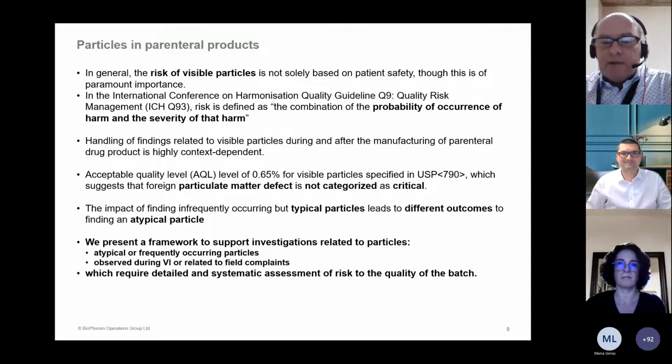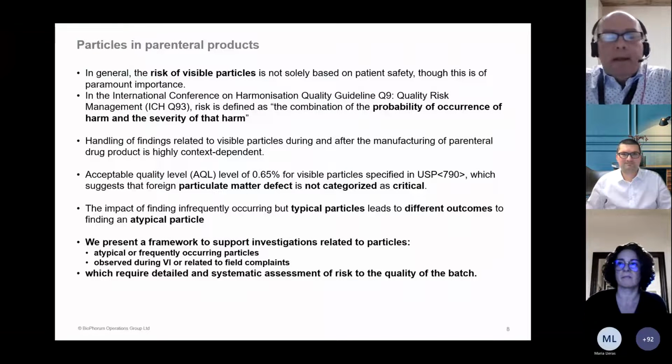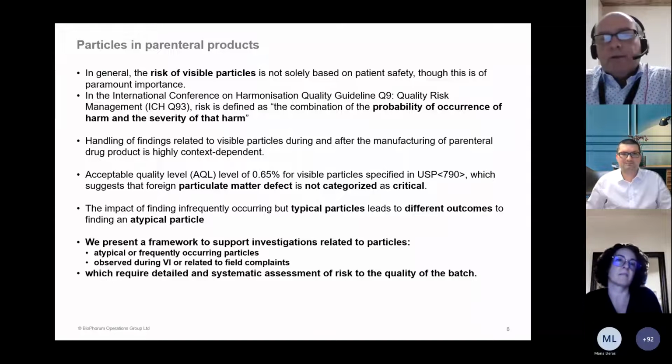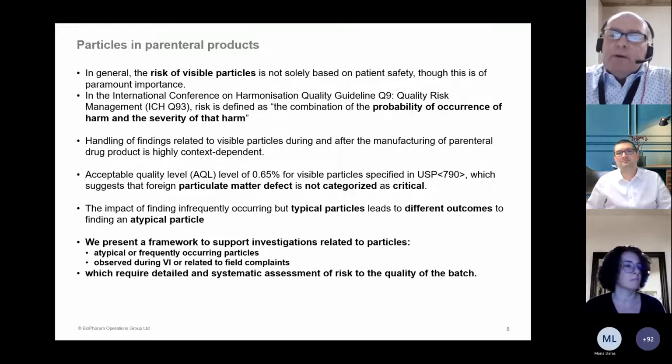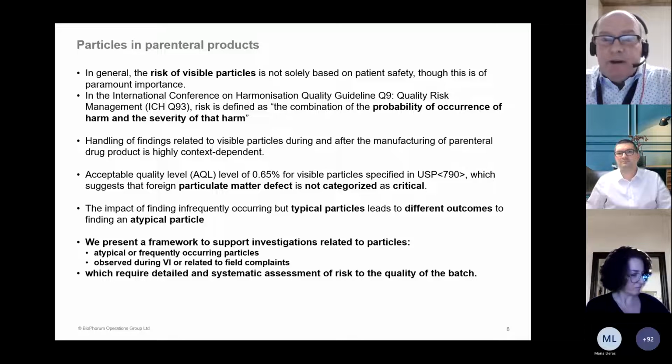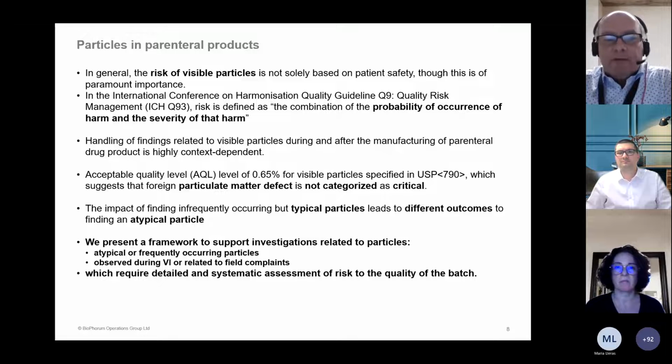Yeah, so you see here a slide, and I'm not going to read everything that's on this slide. You can do that on your own. But I want to tell a few things. So I think that everybody on the call knows that a major cause of parenteral products recalls is due to particles. So it is very important to reduce the introduction of particles, but as everybody knows, it's not possible to have zero particles. Therefore, it is important to manage the risk when particles are found. And dependent on the particles being typical or atypical, the outcome of the risk assessment where we are going to talk about can be fully different.